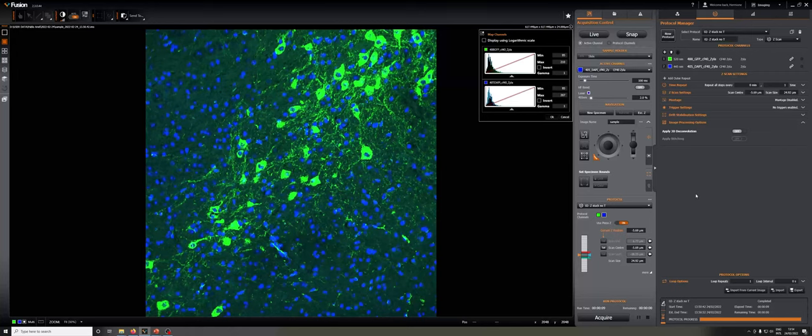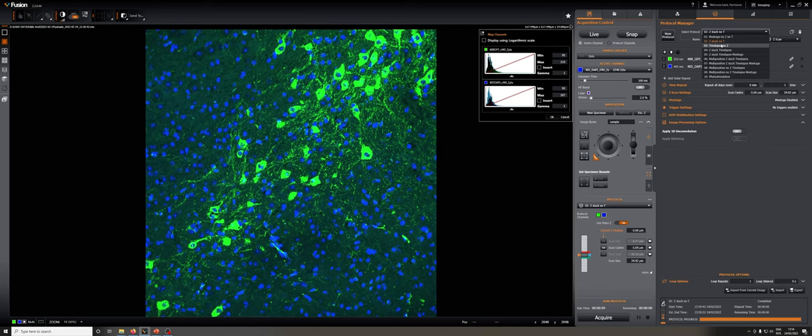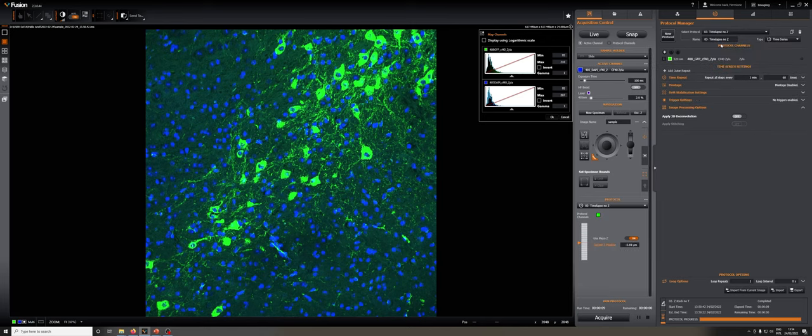So let's discuss another protocol, in this case a time-lapse without any z. This is a time-lapse at a single position with no z-stacks.